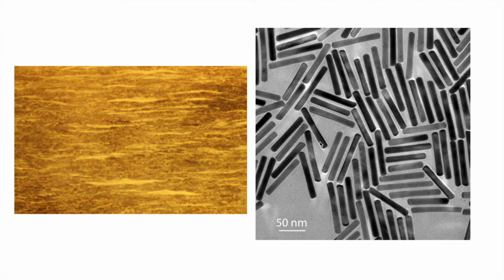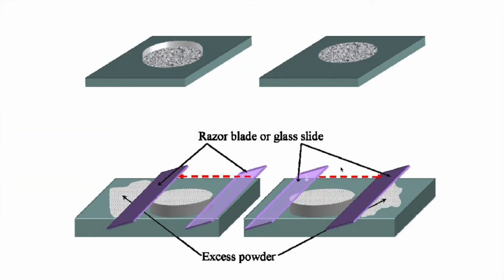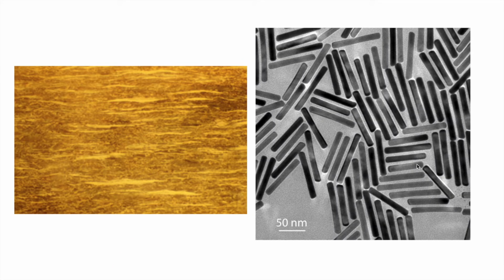So the flat regions here tend to always be a specific crystallographic plane, just like the other faces would be a specific crystallographic plane. So as you might imagine, if you lie these on a substrate, like our holder back here, they tend to lie with the flat side down. And so this is, again, another example of a very preferred orientation.